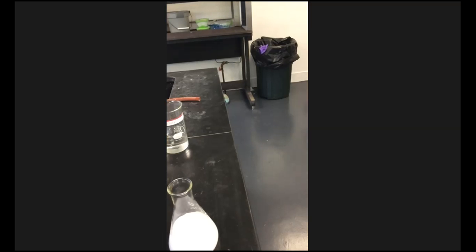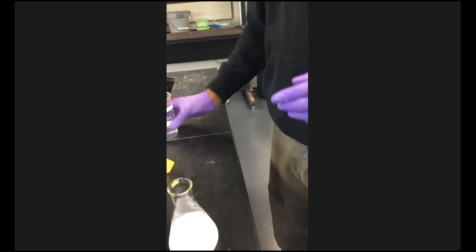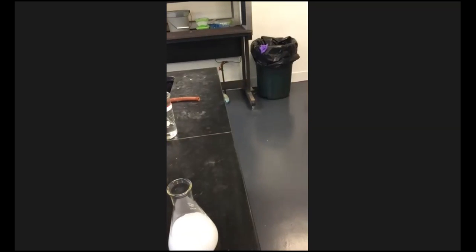It said 50 mils. All right, that's what I need to see. So I'm gonna take another Erlenmeyer flask, and I'm gonna take that water and start warming it up, so we can be efficient and we're not just like watching paint dry. Even though the 15 minutes are gonna feel like that, so don't trip about that. It's just one of the things.